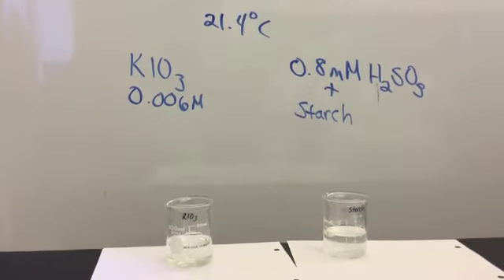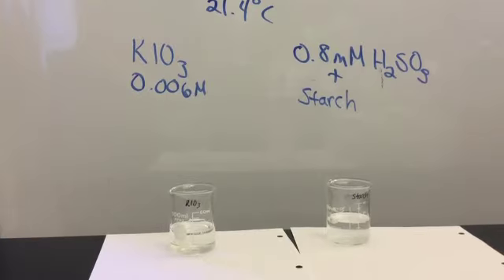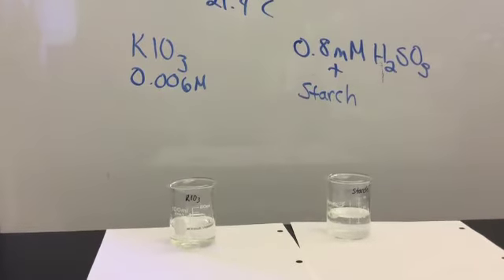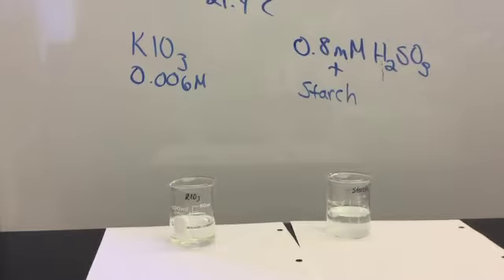Notice that both of our solutions are colorless and the starch is very slightly cloudy, but the potassium iodate is clear. Ideally we would have a clear starch solution, but soluble starch isn't completely soluble and sometimes there's a slight cloudiness to it.